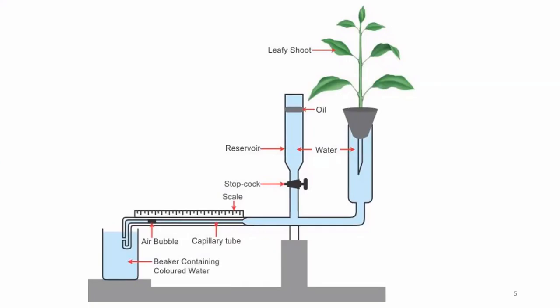Then we measure the water movement by the bubble's movement with time, and repeat this experiment and take more readings. Good, fine. Thank you.